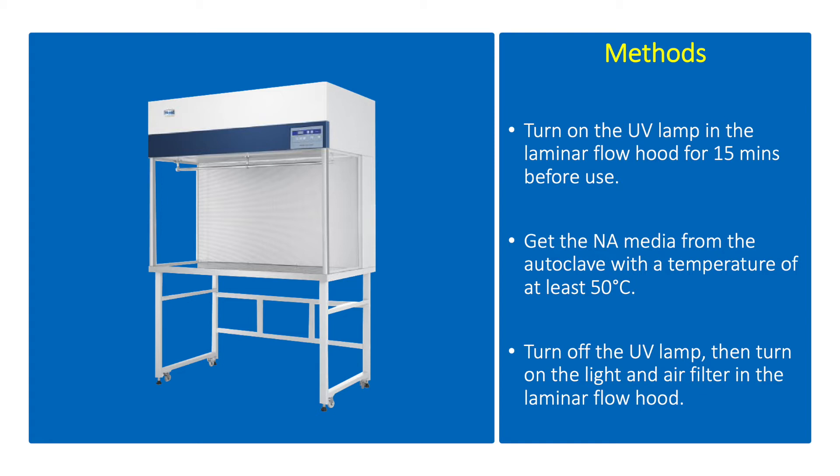Turn off the UV lamp, then turn on the light and air filter in the laminar flow hood. Do not put any materials in the laminar flow hood aside from the sterilized plates, culture media, and alcohol lamp.